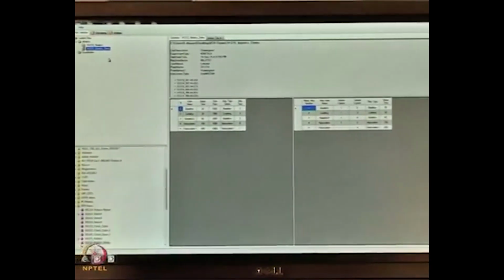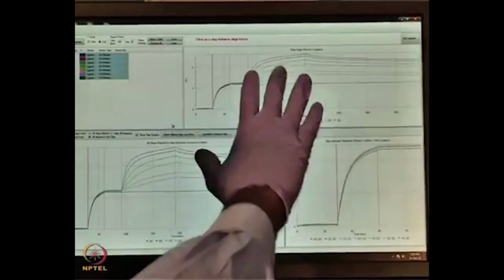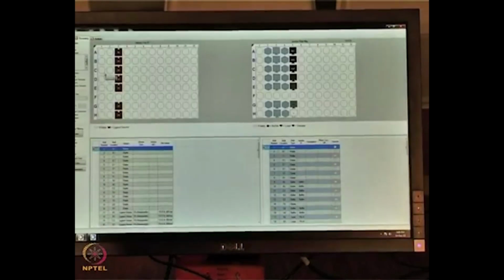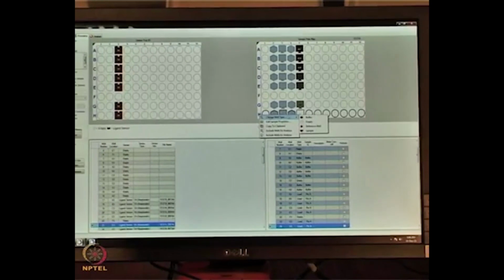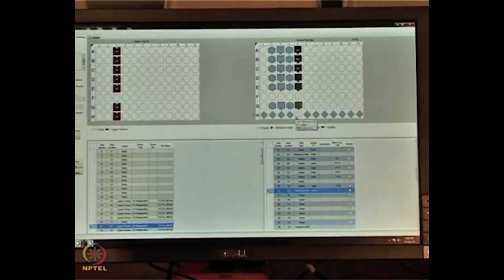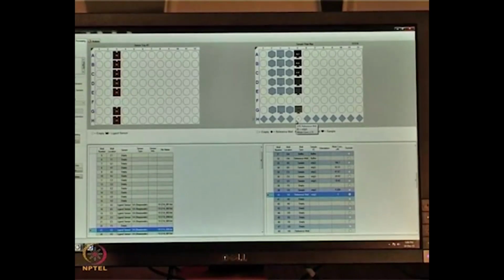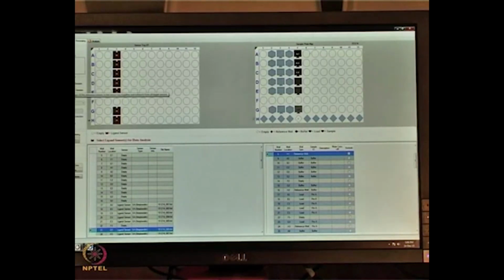You can see that a page got opened, I will go to processing here. In the processing tab, we will see the raw data. What we are doing is subtracting. In one of the columns I had put a 0 concentration. This column I will change to the reference well. This is the 0 concentration, because some of the artifacts from the buffer we can subtract from the data. That is why I am going for the reference subtractions. On the left hand side, here we have the subtraction icon. We have different types of subtraction systems.